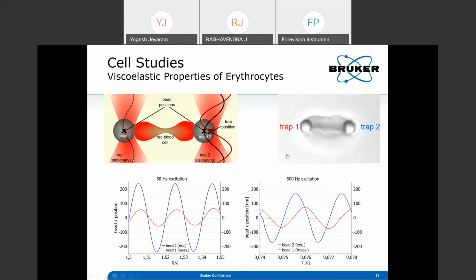We have some standard models that you can use to study this, especially for, say, single molecules, where you have worm-like chain functions and different models. You can get the force data and use the models to study that. Everything is calibrated, so you measure the force in newtons and the position in nanometers or micrometers, everything in SI units, and then you can directly fit the model. The software will do it for you, and then you can play with it. In many cases, as a researcher, you might need to use your own models, because this is still a research area. It's not settled science. Then you can get the data and fit different models of your own to study that as well.